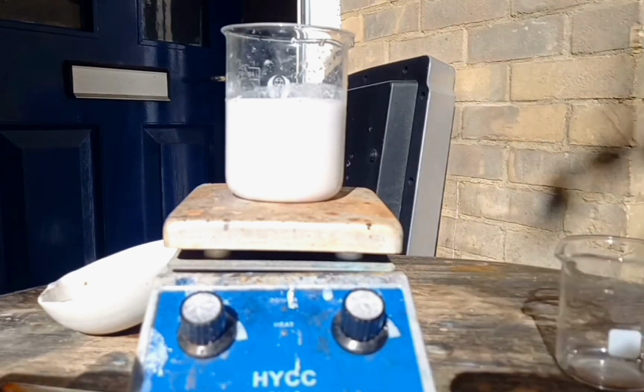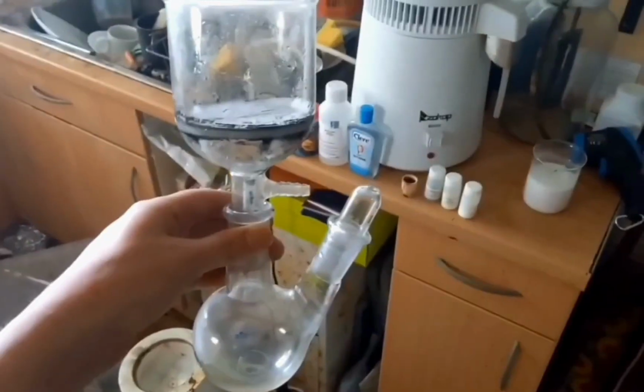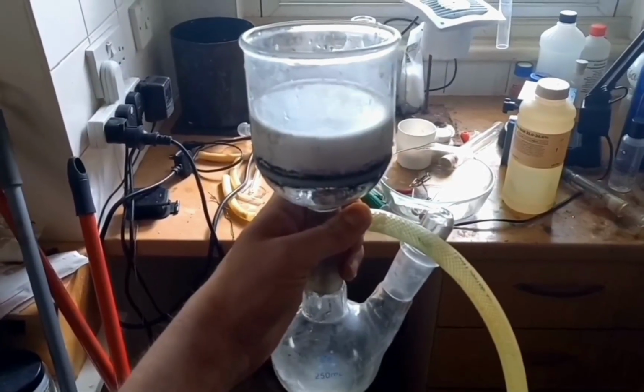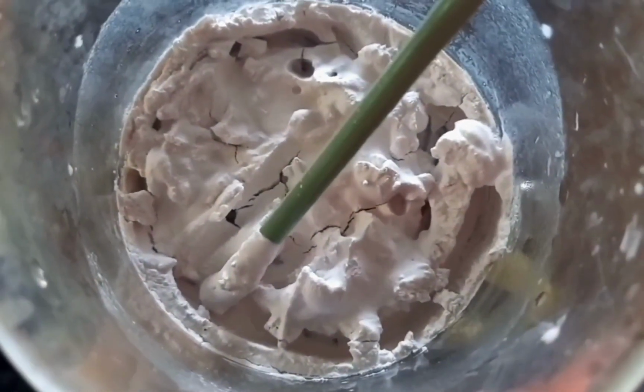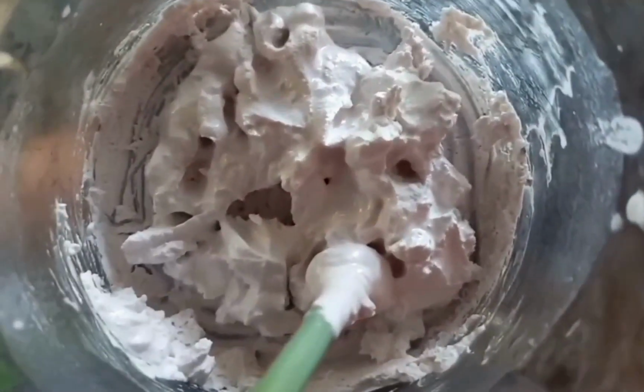And now to filter this. This is to be filtered through this. This is taking a long time.